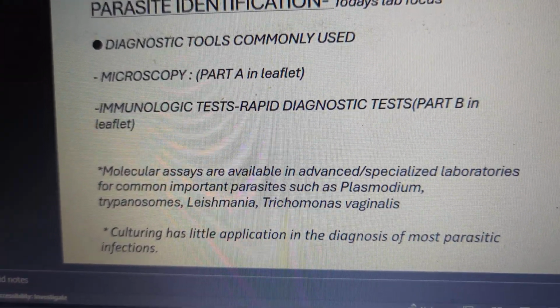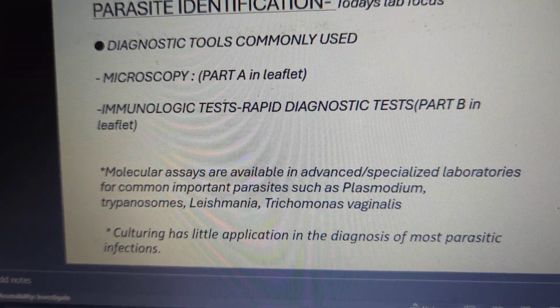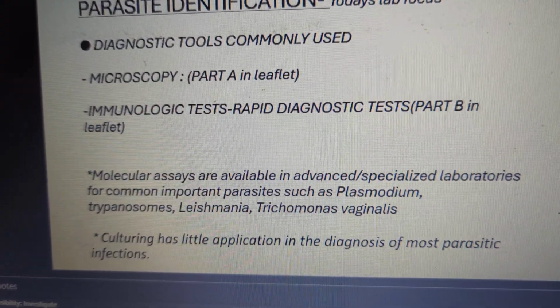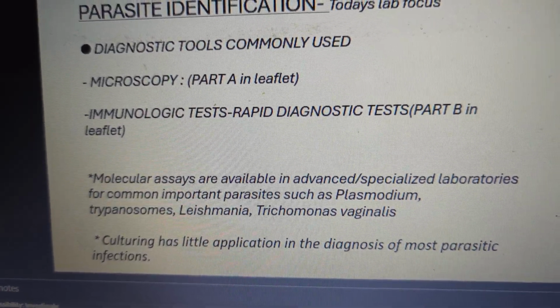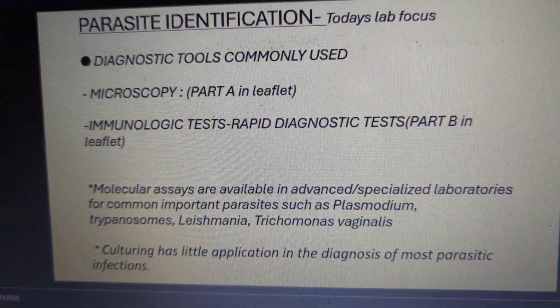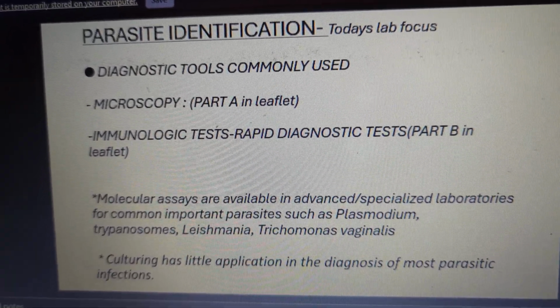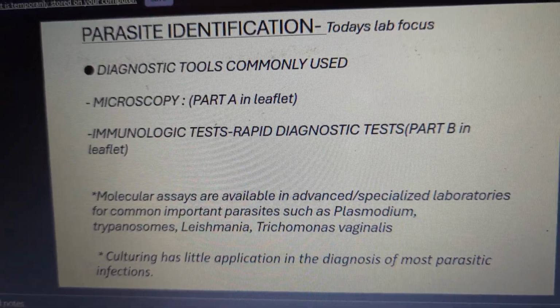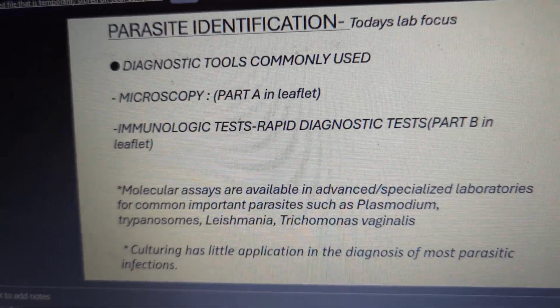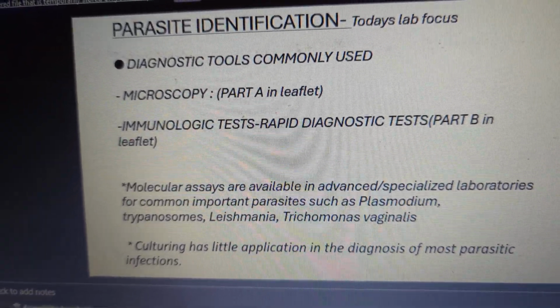Under each part, part A, for example, I have tasks set up for you. When we mention tasks, it's basically the microscopy station, according to the diagnostic stage that you're required to observe. So there will be a task against that microscopy station. I'll run you through what the tasks are, but these are our 2 parts of the session, part A and part B, emphasizing the 2 commonly used methods or tools, diagnostic tools.